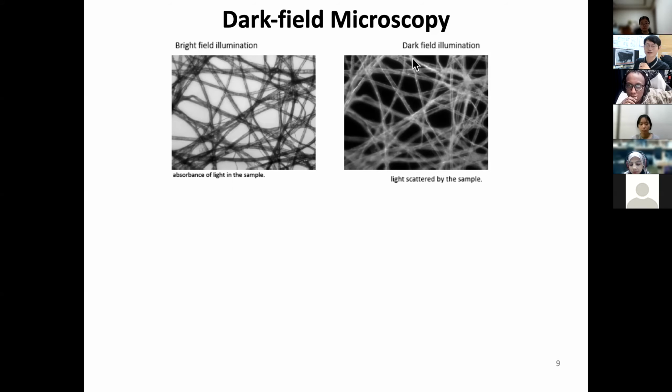This is called dark field illumination. You see the difference of left and right: especially in this dark field, you can find the background is black. So that's great. It actually looks similar to a fluorescence microscope. Usually the background is black, it gives a pretty good contrast, and the sample looks brighter. The reason is the photons are scattered at this sample and get onto your imager.